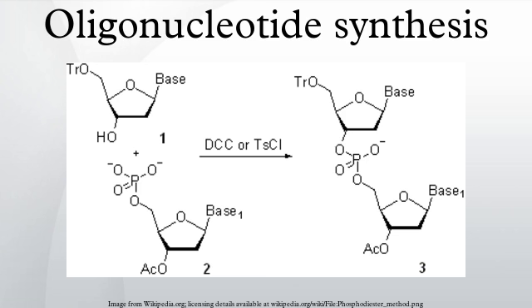A number of oligonucleotide synthesizers for small-scale synthesis and medium to large-scale synthesis are available commercially. Mid to large-scale oligonucleotide synthesis: a history. Large-scale oligonucleotide synthesizers were often developed by augmenting the capabilities of a pre-existing instrument platform. One of the first mid-scale synthesizers appeared in the late 1980s, manufactured by the Biosearch company in Novato, CA.